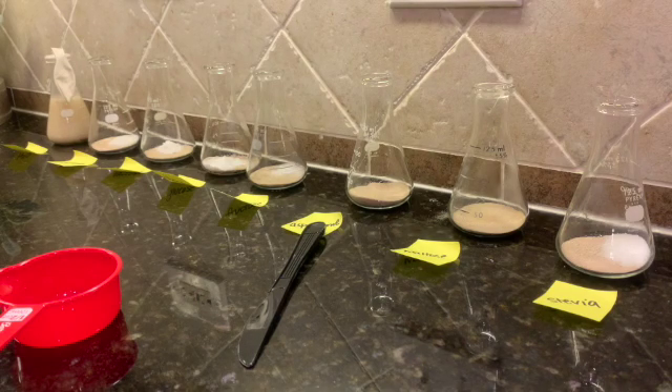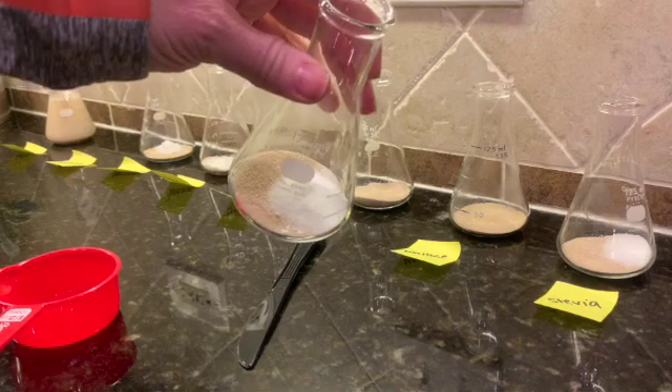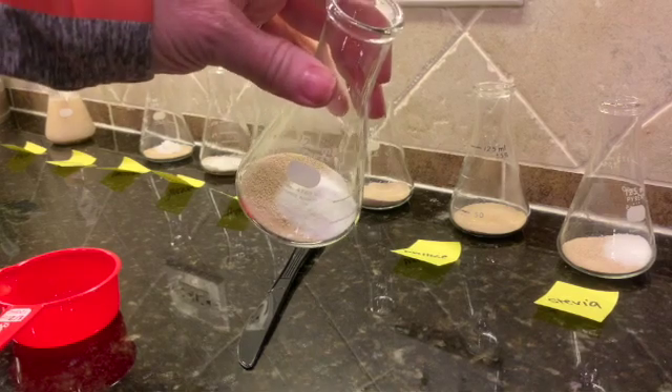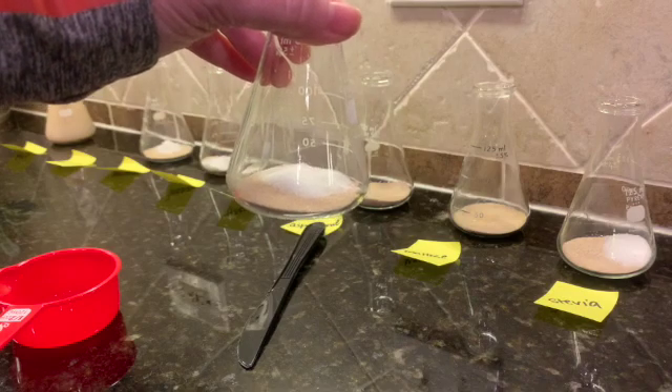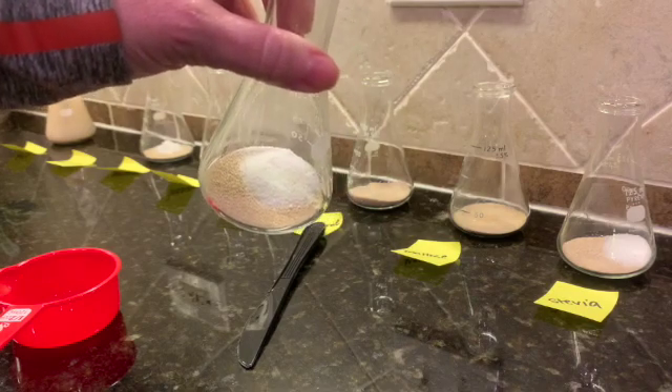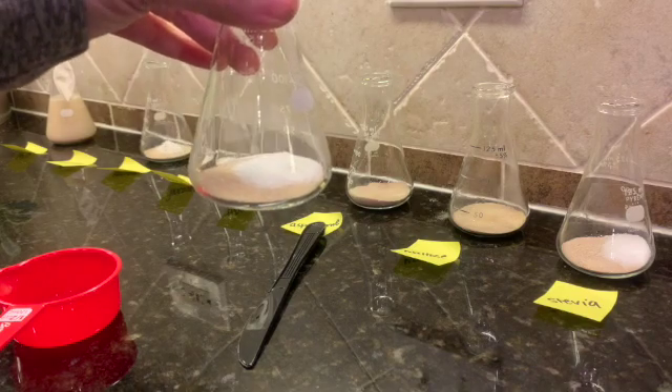I'm going to go ahead now and repeat that for all of our different fleekers — I'm not going to make you watch it all. But for this one, for example, you can see that there is the sugar in there. This one happens to be sucrose, which is just table sugar. And then there is the yeast. I'm going to get all of these set up and then we'll take a peek and see how they look at the beginning.